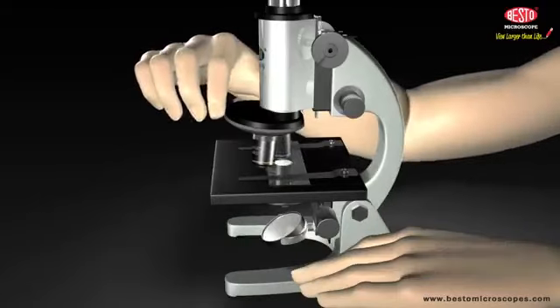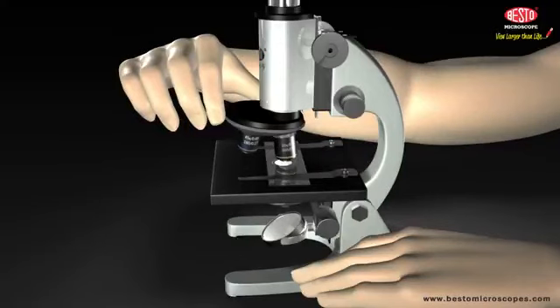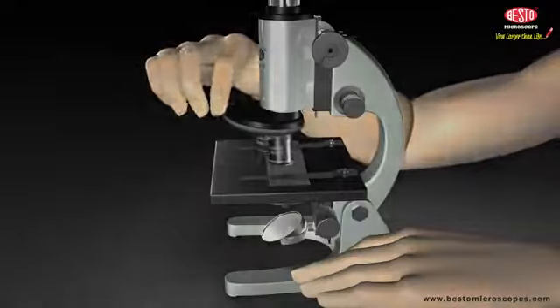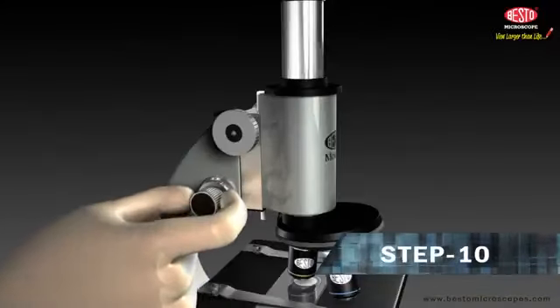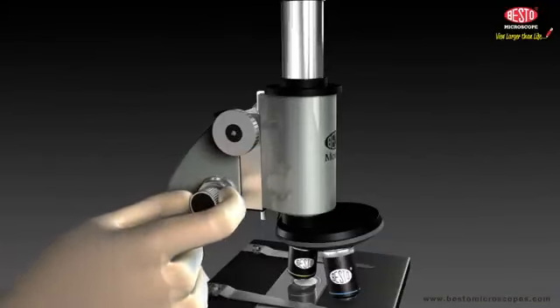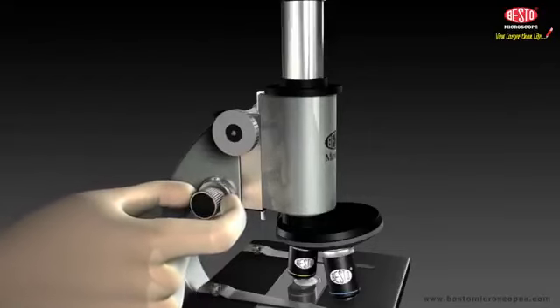Step 8. When the specimen slide comes into focus, it will become sharp and clear. Step 9. To use the high power objectives, turn the revolving nosepiece to bring it into position over your sample or slide. You should be able to see the sample or slide through the high power objective, so you should only have to adjust the fine adjustment knob. Step 10. Now adjust the aperture control with the help of the diaphragm. Close it until the circle of light dims and then open it again slightly and stop where you get maximum resolution of the slide or sample in view.